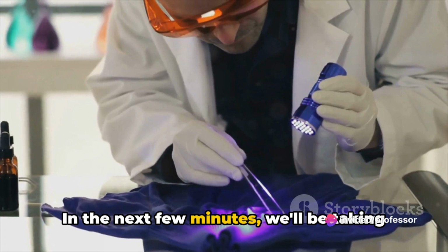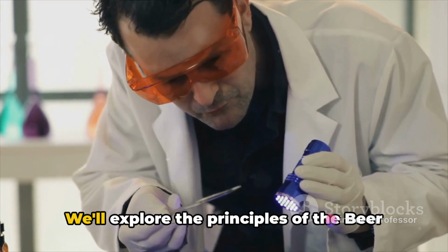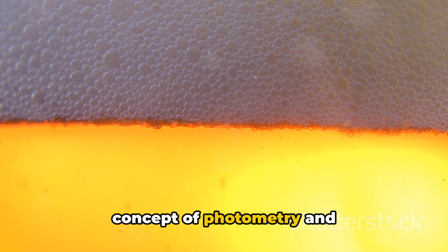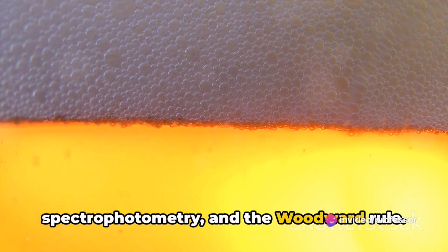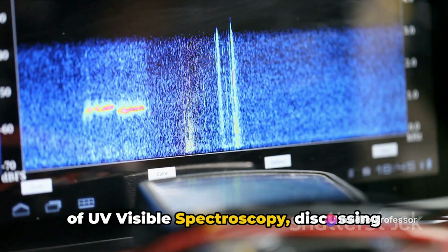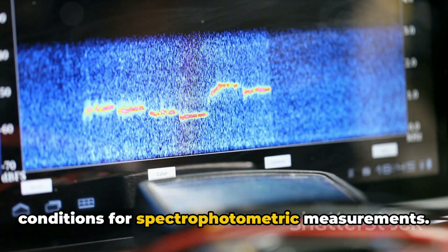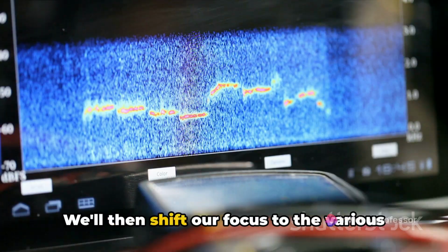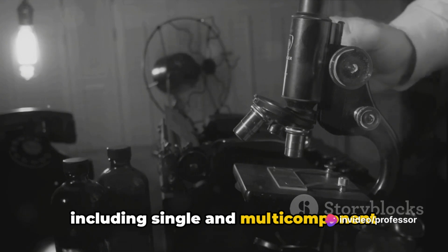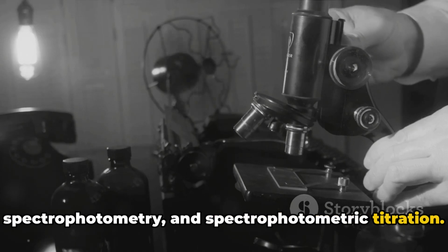In the next few minutes, we'll be taking a deep dive into the theory of UV visible spectroscopy. We'll explore the principles of the Beer-Lambert's law and its deviations, the concept of photometry and spectrophotometry, and the Woodward rule. We'll also delve into the instrumentation of UV visible spectroscopy, discussing single-beam and double-beam spectrophotometers and the optimum conditions for spectrophotometric measurements. We'll then shift our focus to the various analysis methods in spectroscopy, including single and multi-component analysis methods, derivative spectrophotometry, and spectrophotometric titration.